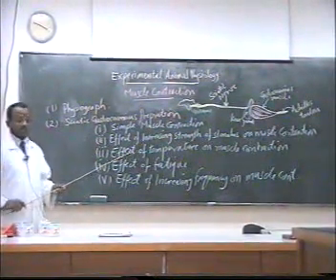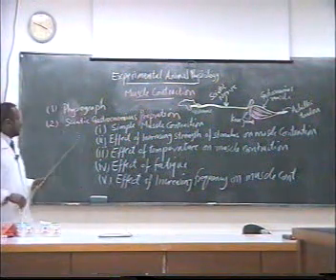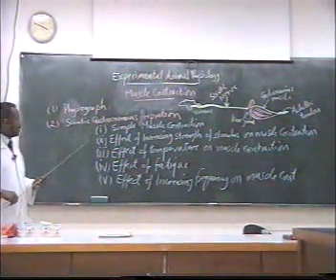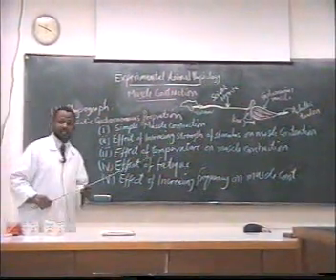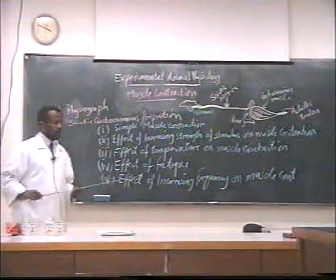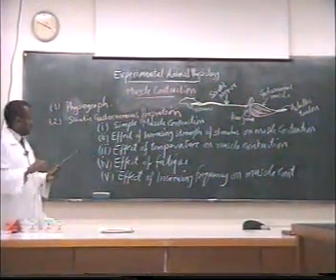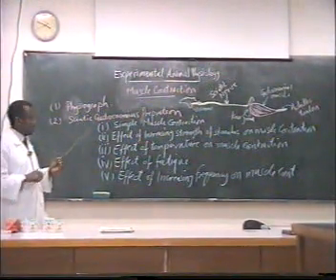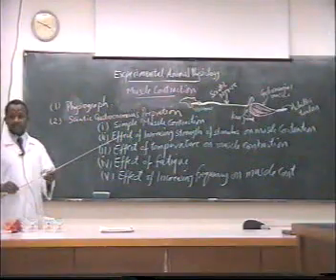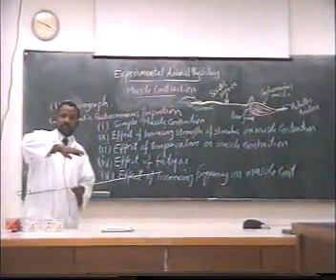After amplification, the electrical signal is reproduced by the reproducer, which is basically a large galvanometer whose arm takes the form of an ink pen.